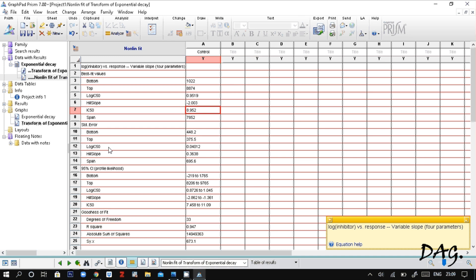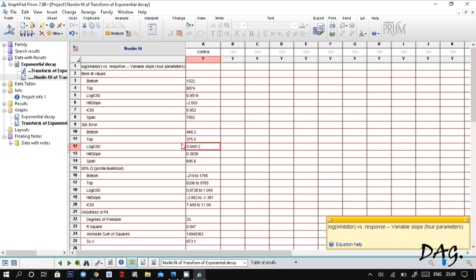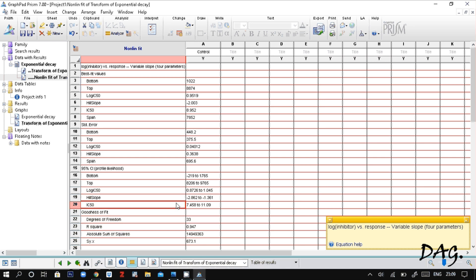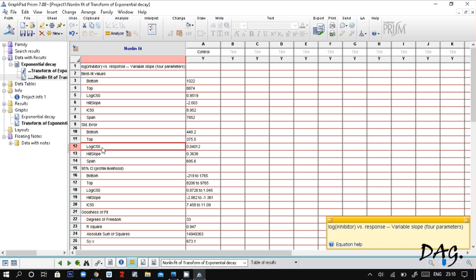The standard error GraphPad Prism gives us is the standard error of the log IC50 value. This is because our data was log transformed — therefore GraphPad Prism can only calculate the standard error of the log IC50 value from this data. GraphPad Prism also outputs the 95% confidence interval of the log IC50 value as well as that of the IC50. In this tutorial we are interested in finding the standard error of the IC50 value, not just the log IC50 value.